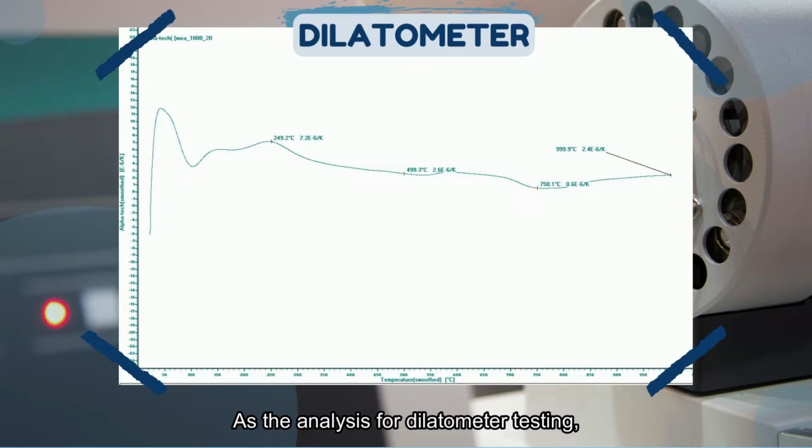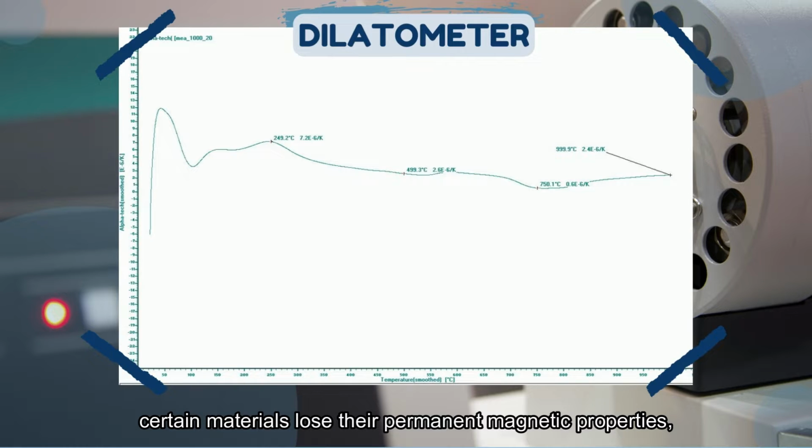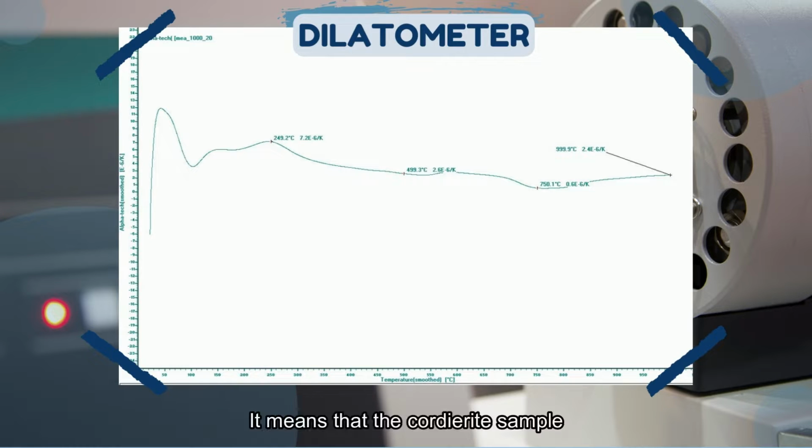As for the analysis of the dilatometer testing, after 50 degrees Celsius, shrinkage was detected. This is due to a change in the atomic structure known as the Curie point. Curie point is the temperature above which certain materials lose their permanent magnetic properties. At 100 degrees Celsius, the sample creates an asymmetric curve. It means that the cordierite sample is increasing in interatomic separation and thermal expansion. As shown in the figure above, the mean interatomic separation increases as the energy associated with the vibration of the atoms is increased. The sample continues to expand until it reaches 249.2 degrees Celsius, which is 7.2 CTE.